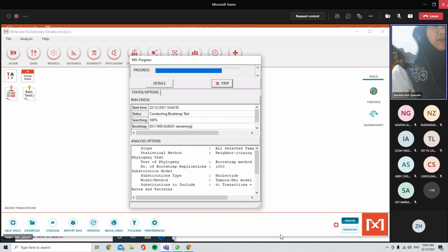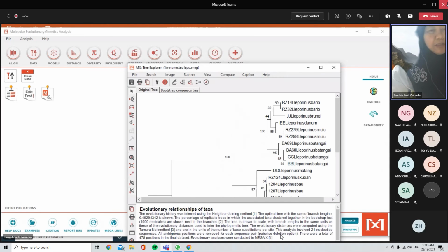You know, saya dah cerita pasal bootstrap method, you have boot and strap. You ambil sebahagian daripada data for your analysis and you tengok sebenarnya what is the relationship. Macam ni ya, that means for this barrier, Brunei, Mulu, Batang Air, you buat 1000 iteration, 100 kali sebab 100 ni 100% dia punya pusat barrier, 1000 time iteration dia akan keluar this kind of. Yes. Terdengar ke? Yes.